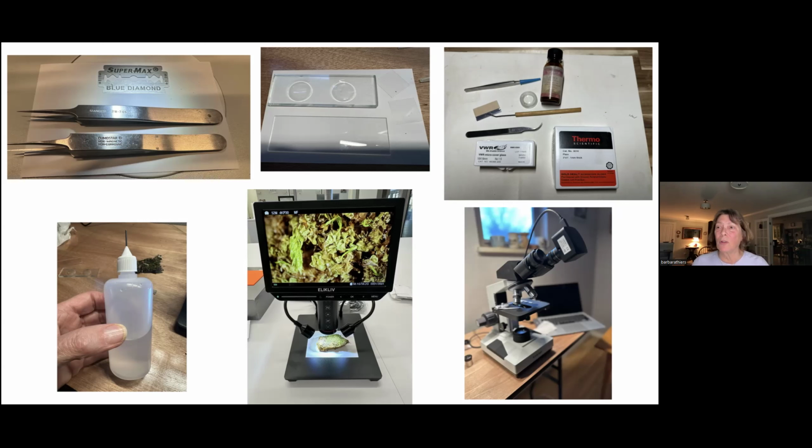I can add to it, but one of the most annoying things is to put too much water on a slide, and then you put your leaves or your sections and either there's so much water that you can't focus well on them, or the things that you most want to see go floating out from underneath the cover slip. So these I bought fairly recently on Temu, $3 apiece, but I had to buy six. They're water bottles with a very fine point.